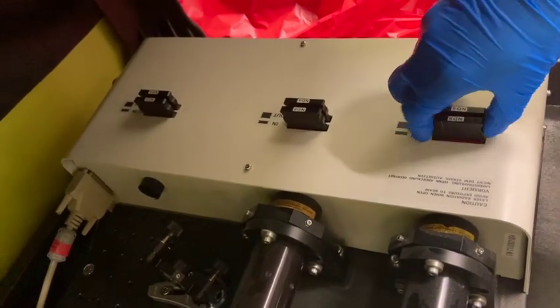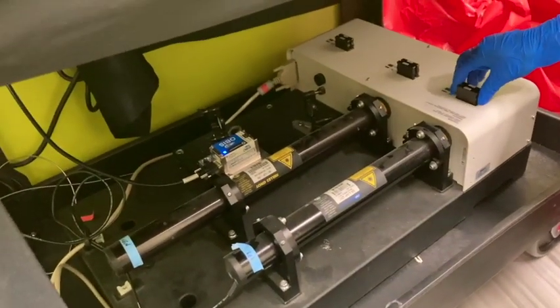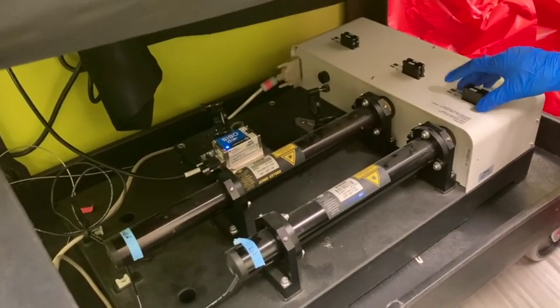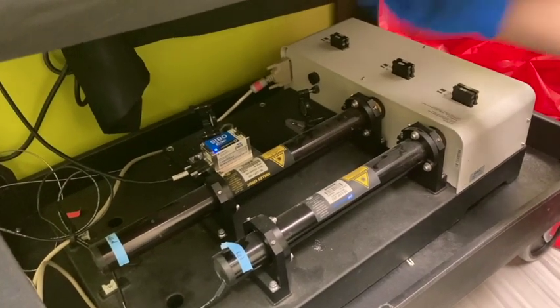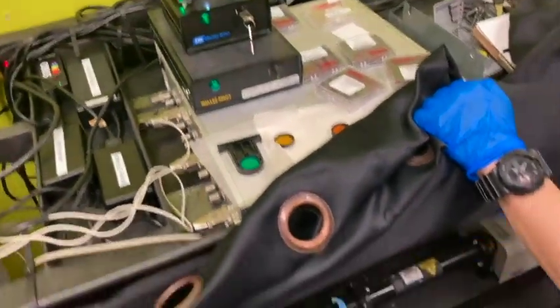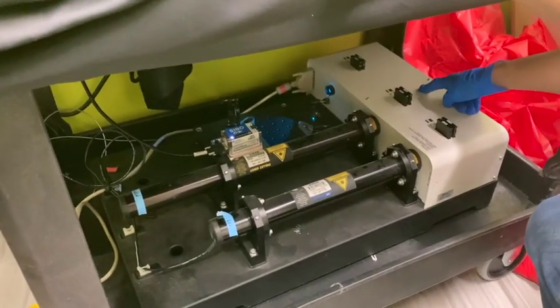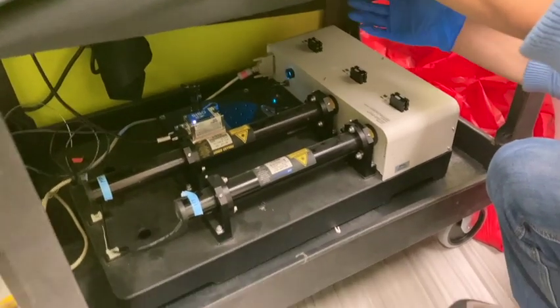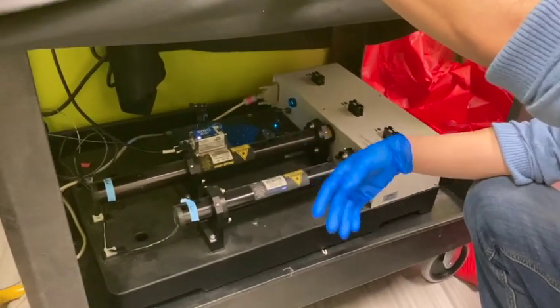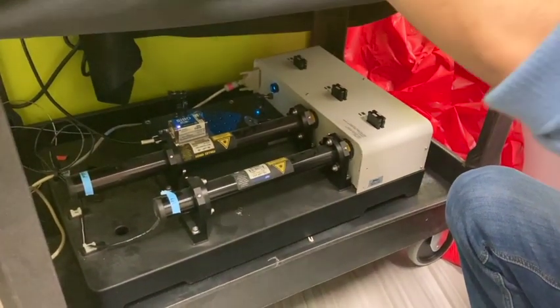Because the laser here is already very weak, most of the time we want this neutral density filter being pulled up. So now this is steady. We can turn it on and we will see blue light coming through. There is a shutter here. The shutter decides which laser you want to pass through. You can pass through 1, 2, or all of them, and it's controlled by the shutter control over there. I will show it later.